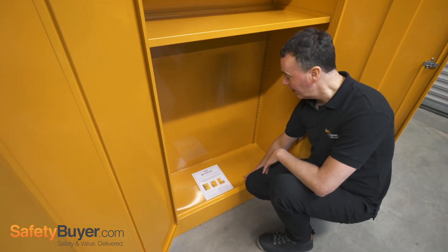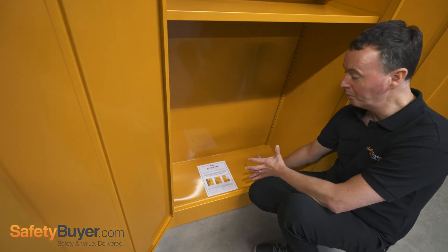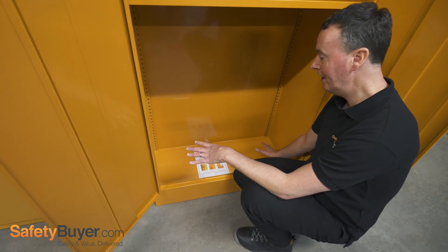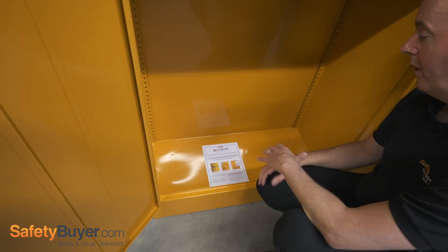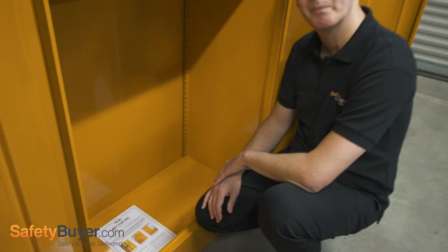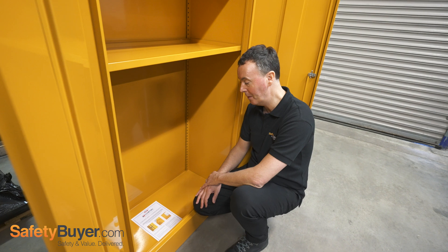It's going to be contained in this generous sump. It's a 50 litre sump capacity. It's fully welded — there's no tray to remove and it's leak proof. It's fully welded to all the seams and that's going to keep any spill contained in the base of the cabinet.